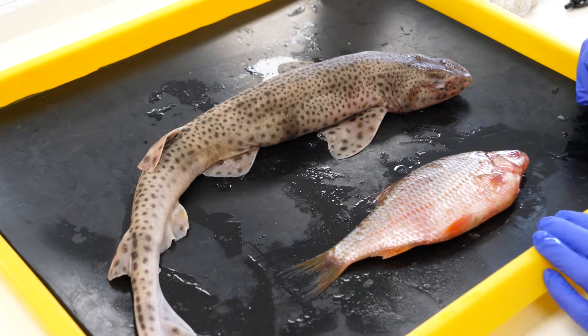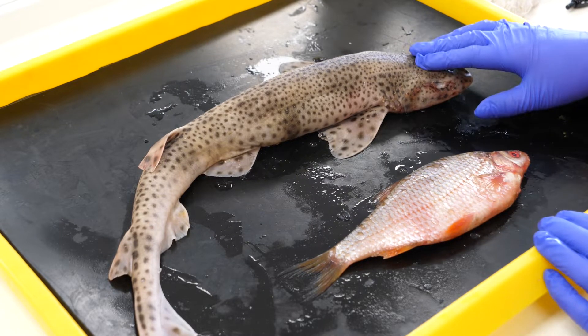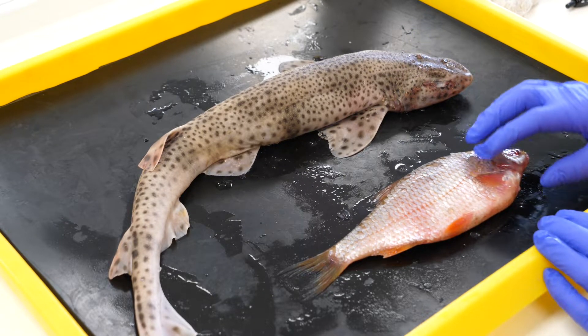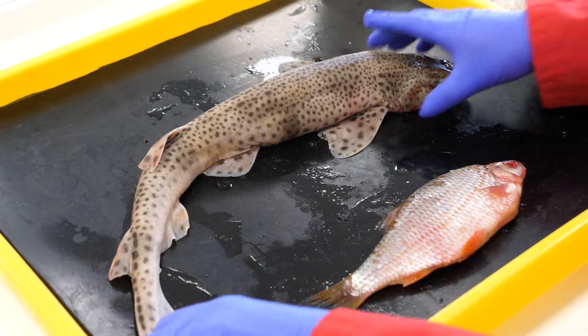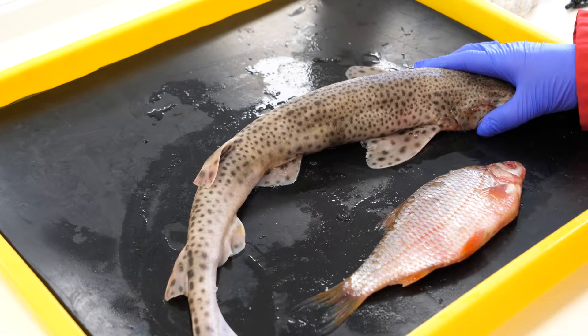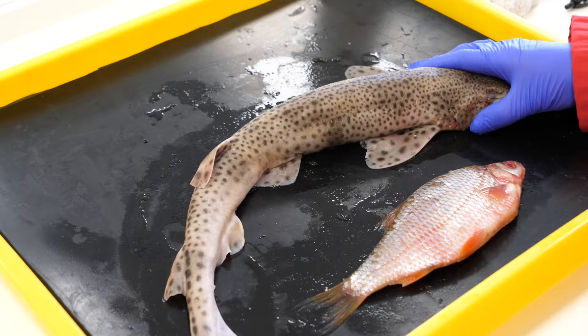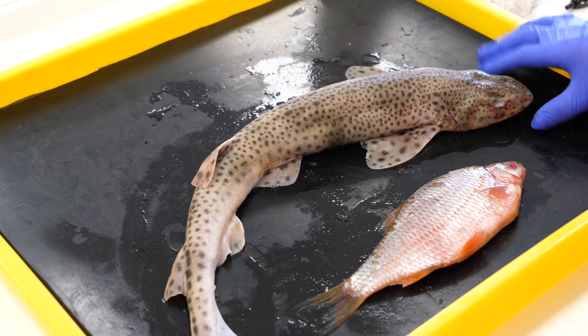Okay everyone, we've got our fish dissections today. So what I have here is a dogfish, so this is a shark, and we've got a bony fish, this is a roach. I'm just going to talk you through the external anatomy and show you where you would cut to do your dissection. And then in a second video we'll show you the internal anatomy of each of these animals.